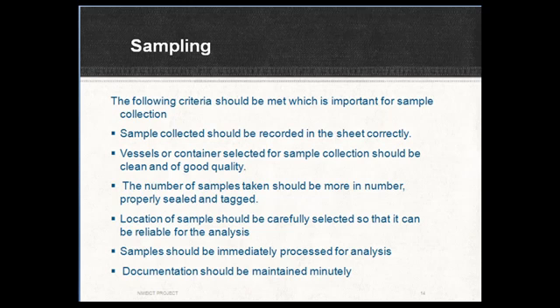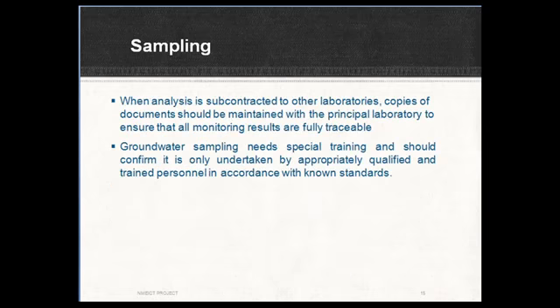Samples should be immediately processed for analysis. If not, then should be preserved appropriately, which met international standards. Documentation should be maintained minutely. When analysis is subcontracted to other laboratories, copies of the documents should be maintained with the principal laboratories to ensure that all monitoring results are fully traceable.